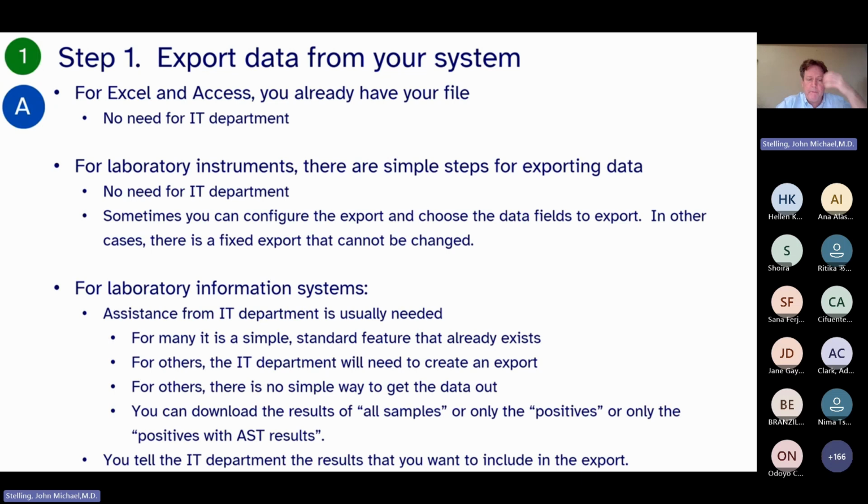Unfortunately, for some lab systems, especially, I go to some facilities, somebody made an IT system 5 years ago. That person is no longer available. They don't have any way to get the data out. Or sometimes the data are stored in PDF documents, and we can't extract easily data from a PDF document. So I would suspect most of you are in the situations here of 1 and 2, a standard feature that exists or another feature that can be developed.